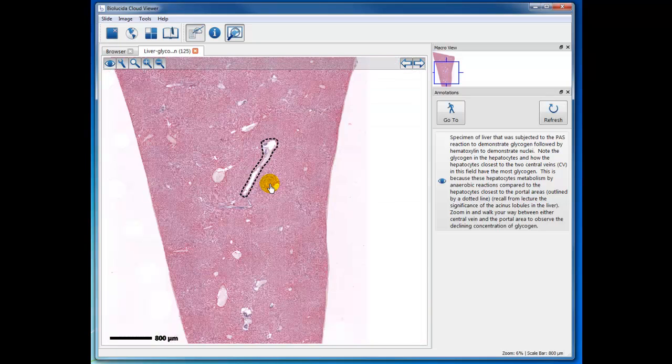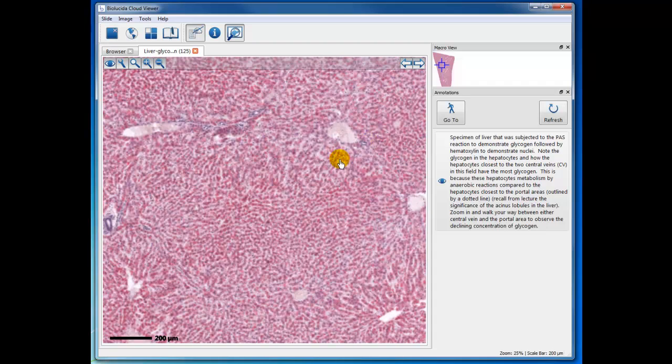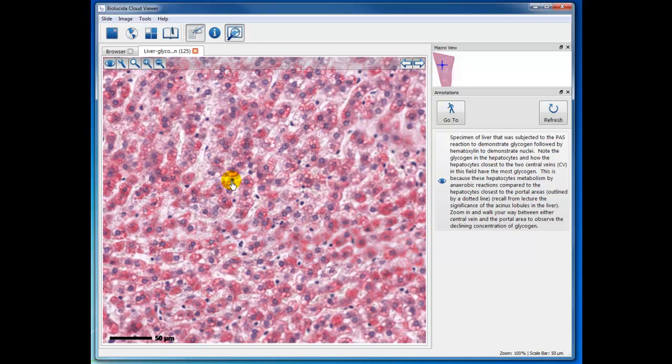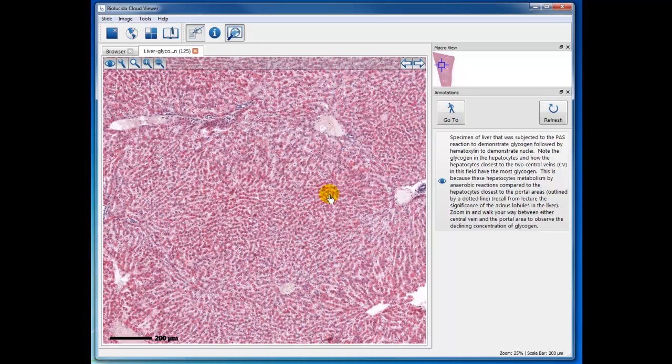And that's where you find the first storage of glycogen in the liver. So study this specimen with reference to not only the morphology, which is pretty good, and seeing the portal areas as well as the central veins. You probably won't be able to recognize for sure Kupffer cells, like this may be a Kupffer cell here, this nucleus that's present in here, and if I enlarge that just a bit, it'll be out of focus, but that's most likely a Kupffer cell nucleus. But of course, when the Kupffer cells have engulfed something like in the carbon injected specimen, they're pretty easy to see. So let's go to the next specimen now.